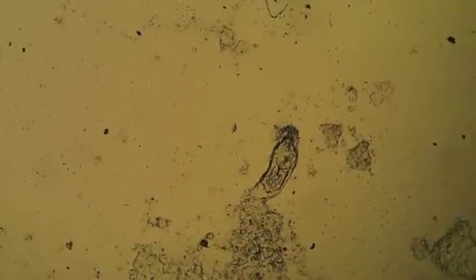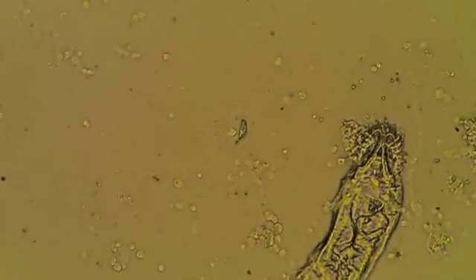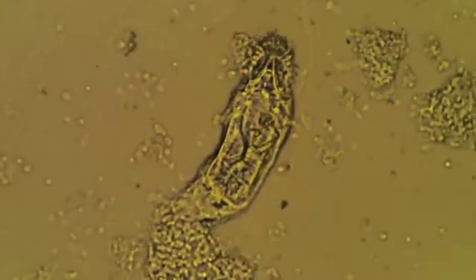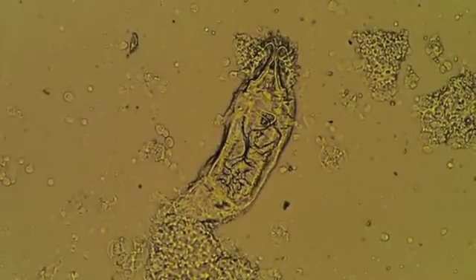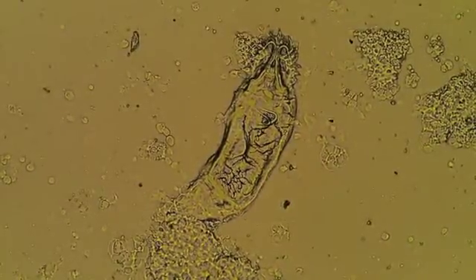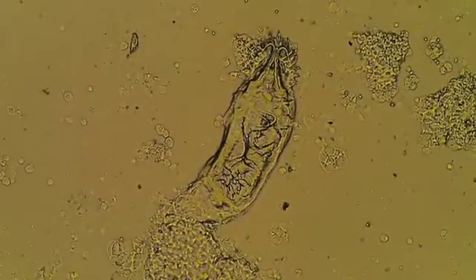Here I've loaded another slide — this is one of a skin fluke. At four times objective, moving up to ten times objective, what we're looking at here is not as brown looking as the gill flukes. They actually don't contain any sort of pigmentation at all. And you can see the very large haptors on the top of the screen, and there are no eye spots at the bottom of the screen.